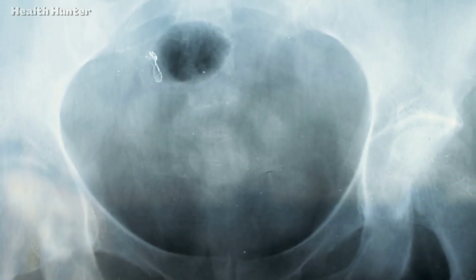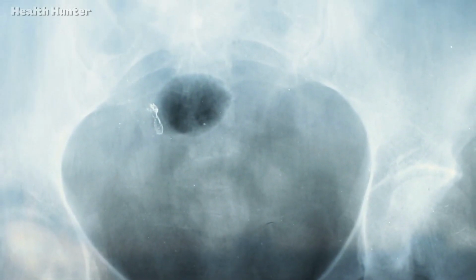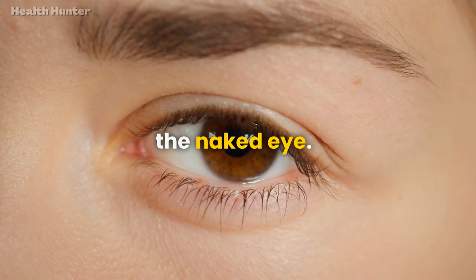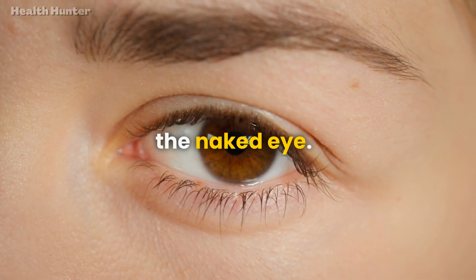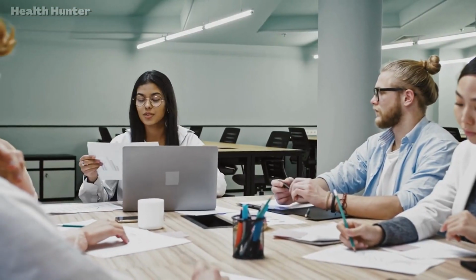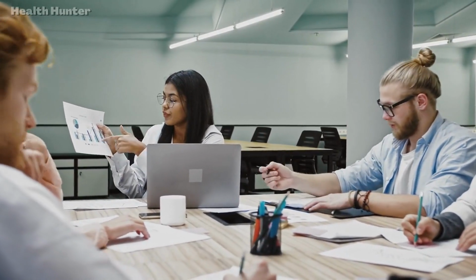Calcium oxalate crystals are the most common type of kidney stone, accounting for about 80% of all cases. These crystals can vary in size, from microscopic to large enough to be visible to the naked eye. Sometimes they can clump together to form larger aggregates, which can be even more concerning.